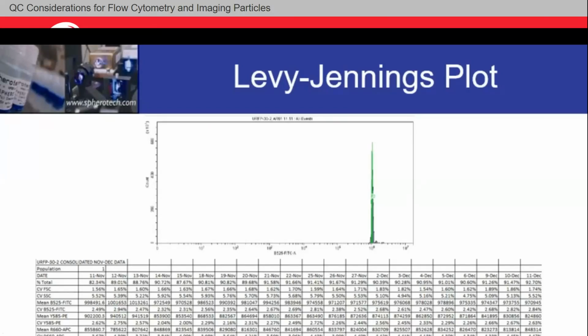And you should be running these every single day, 30 to 60 days, recording them, making sure you know what your parameters are, because nobody can set the parameters for your flow cytometer except for you or your SOPs in-house, your QA, QC team. And as you see, we have this upper line here, probably going to be associated with that side scatter.